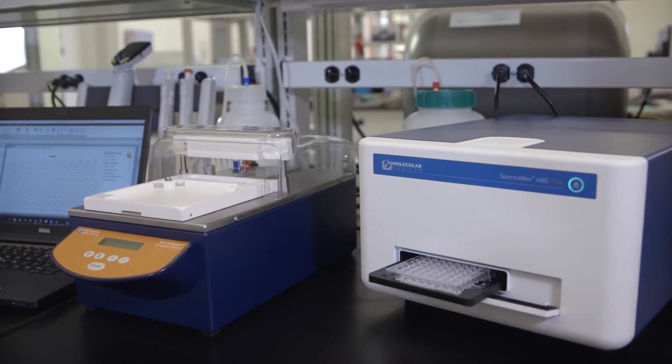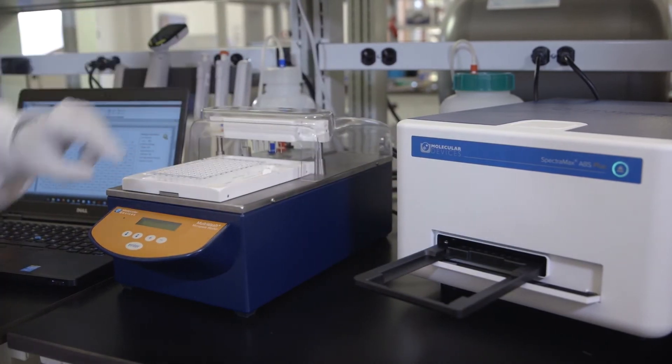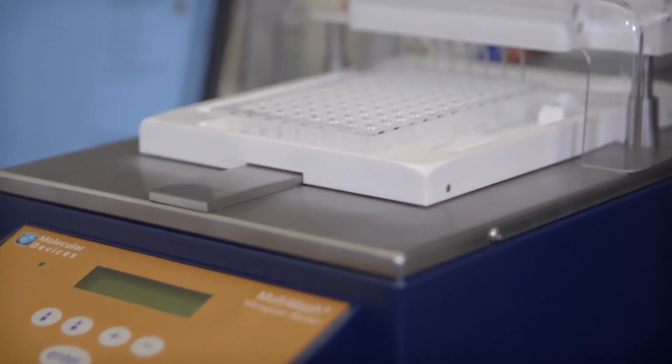The automation-friendly SpectraMax ABS Plus is a perfect fit for your existing ELISA workflow. It integrates seamlessly with microplate washers.